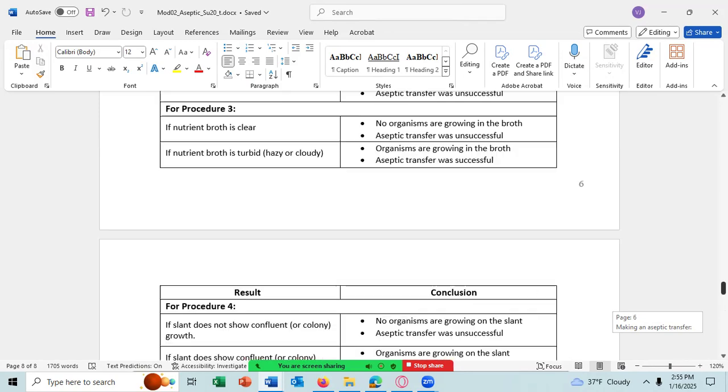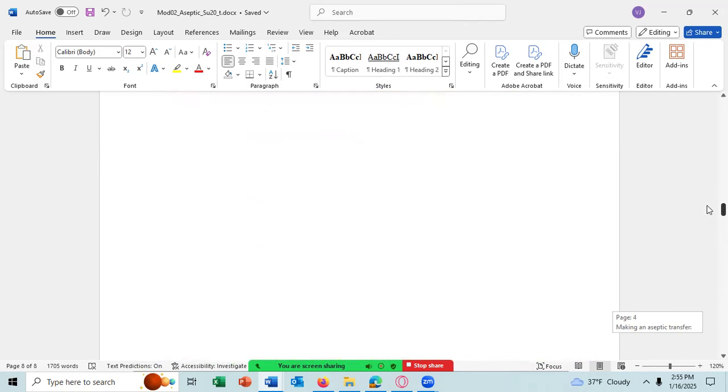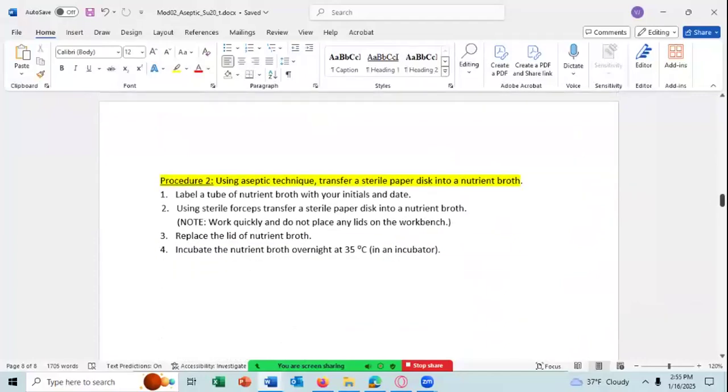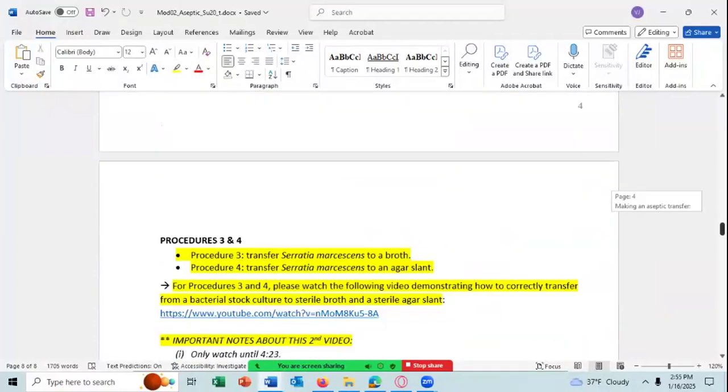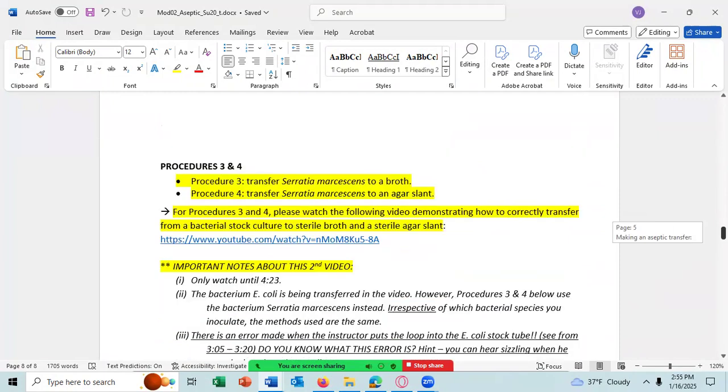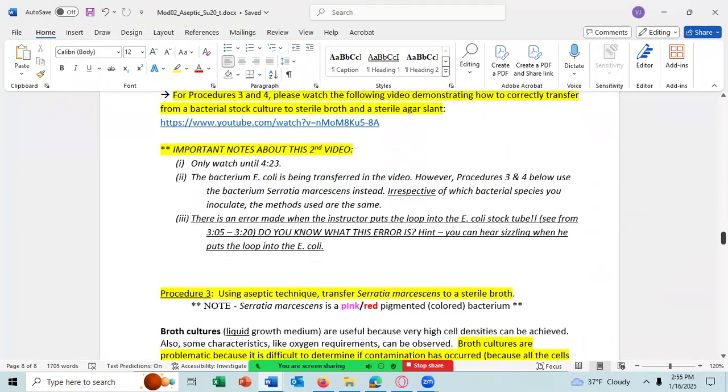All right. For procedure 3, we're going to be transferring Serratia marcescens to a broth culture. There's some notes about, you have a little video for transferring cells into a culture, and you can watch this little video. You only need to watch this video to 4 minutes and 23 seconds.